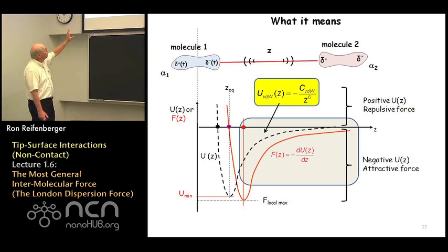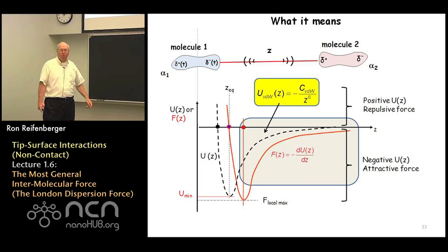We're really interested just in the behavior of this interaction potential energy that's localized inside this gray box that I've indicated. Right? We're not so much worried about the repulsive interaction potential energies that occur when these two things get close together. That's more a point for discussion in week 2.